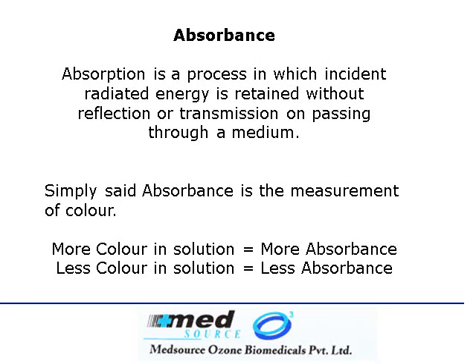So if you take some water and put 5 drops of ink, it will have a slight blue color. And if you put 20 drops of ink, it will have a dark color. And if you put 50 drops of ink, it will have a very dark color. This is what the Beer-Lambert's law says, and this is what the absorbance says. 5 drops of ink, less color. 20 drops of ink, more color. 50 drops of ink, very much color.